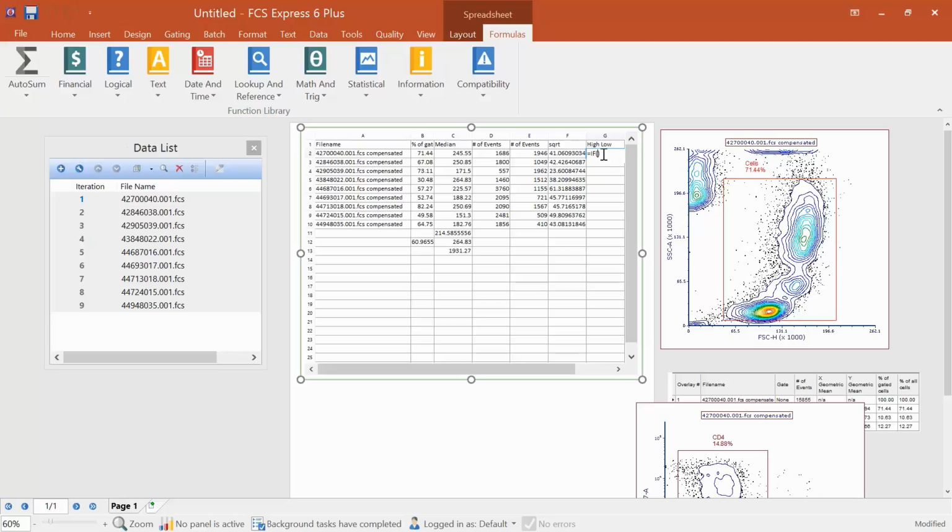Now the criteria for this is we want to evaluate this particular cell, and we want to say if that value is higher than 40. We now need to put in some operators here. We're going to put in a comma and say high, and if we put in another comma and a quotation there, that's going to indicate if it's not high, then it's low. So press enter. And you can see we have evaluated that function. Again, we'll copy this down, and you can see that we found one value here that's less than that particular range threshold that we set in the if-then statement.